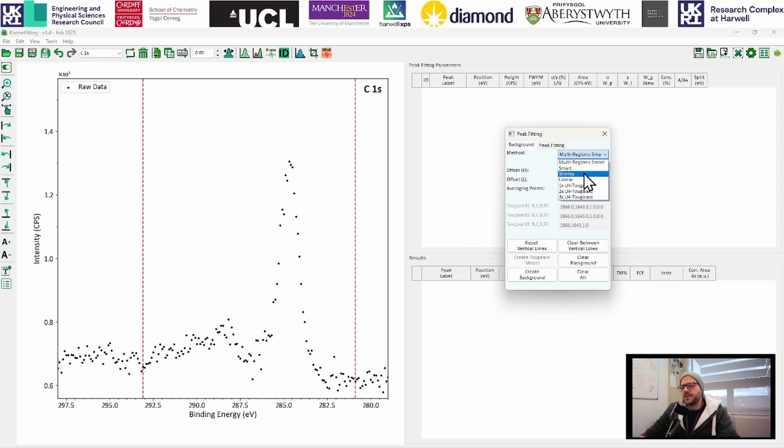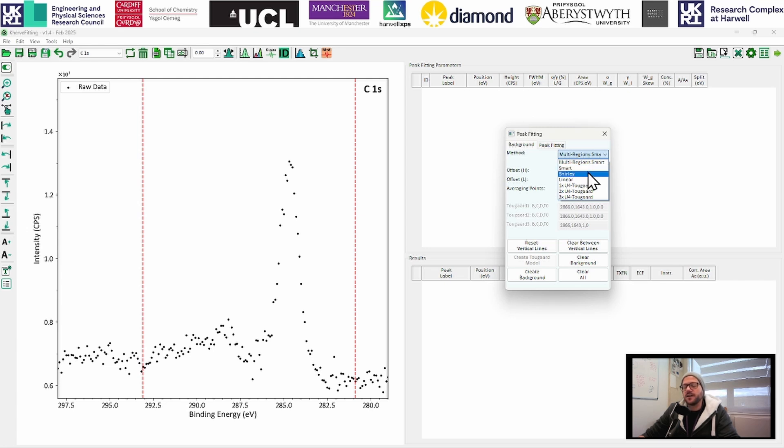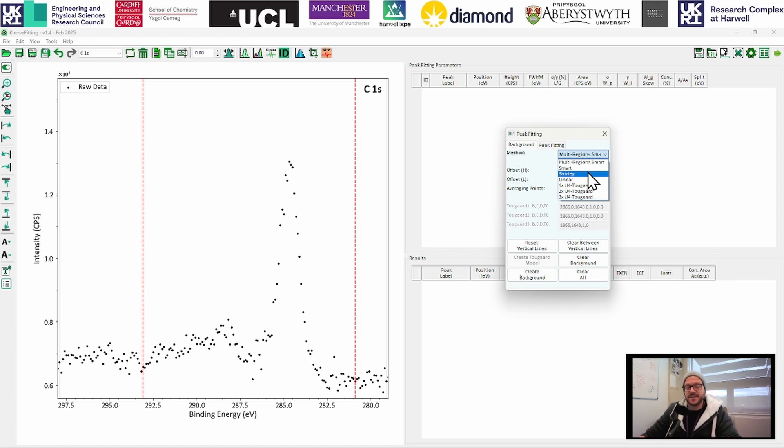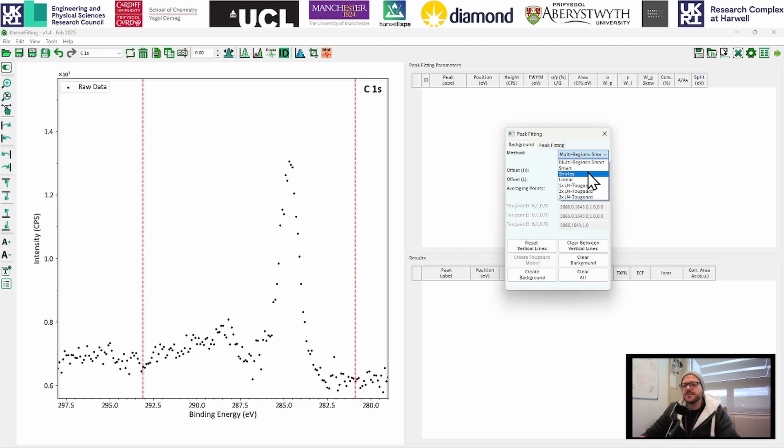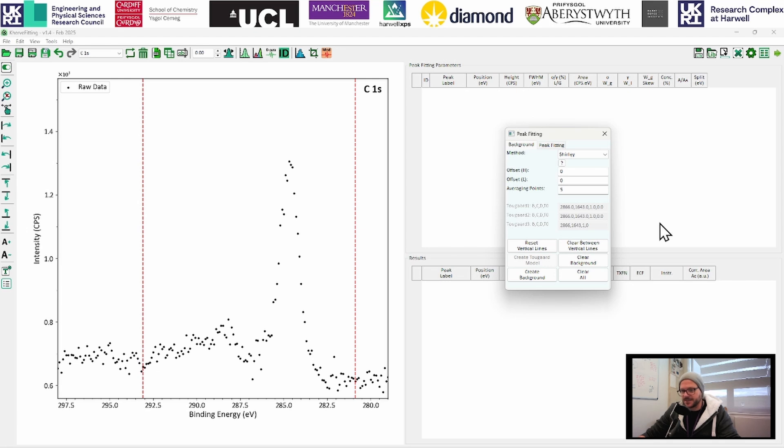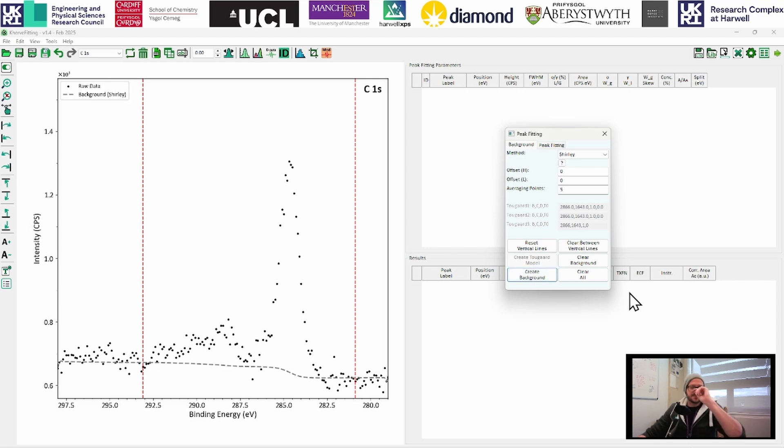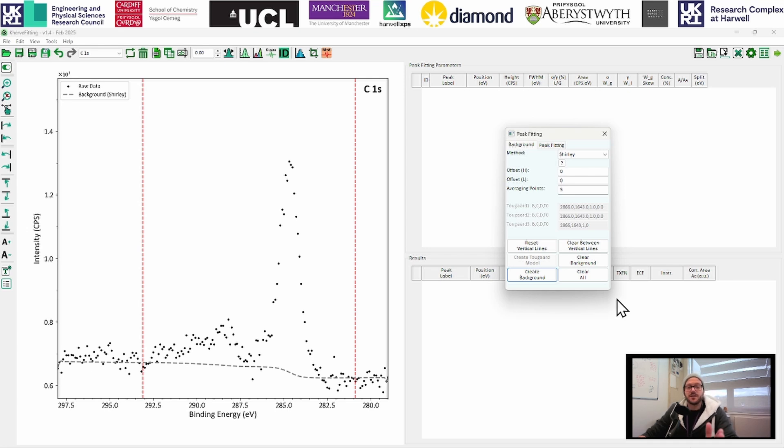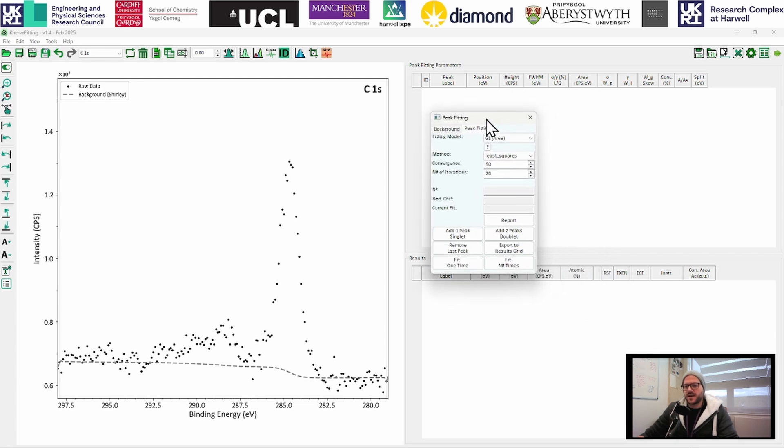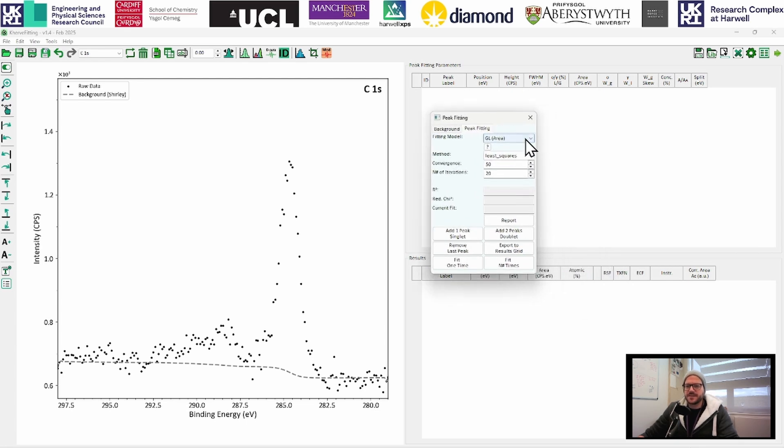So the smart and multi-region smart, again, if you're familiar with Avantage, you will be familiar with what these are. If you are unfamiliar and more of a CASA user, essentially, these will try and fit the best background it can, depending on the data and the region. We're going to stick with Shirley background for now so that everyone's comfortable, everybody knows what this is. And I'm just going to click on create a background and that inserts this Shirley background in here and making sure it goes through and passes through the limit points that we've set.